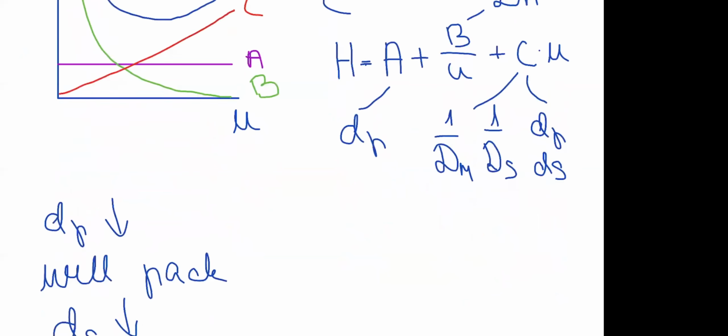Okay, so maybe just to remind you that to get efficient chromatography, we wanted to have low peak widths at the half height.